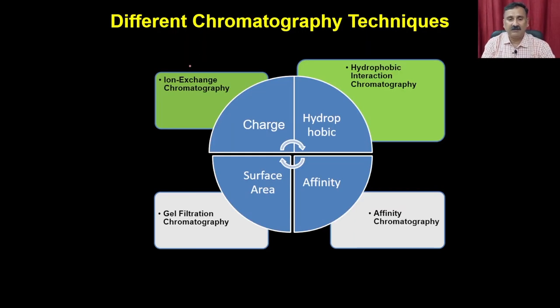So far we have discussed ion exchange chromatography, which exploits the presence of charge on the protein structures. And then we also discussed how the hydrophobic patches present on the protein can be exploited in hydrophobic interaction chromatography. Now in today's lecture, we are going to start the discussion about gel filtration chromatography.